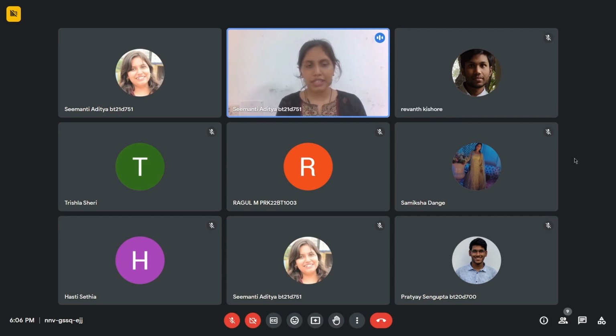For those doing dissections or primary cell cultures, like isolating cells from animals, people prefer to have a dissection hood or an area that is separate from the normal secondary cell culture hood. A separate area for dissections and the cell culture hood is required for reducing contamination.